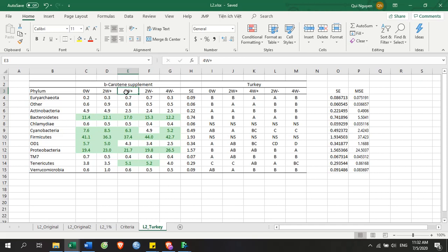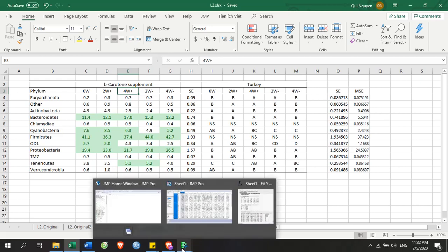So okay, now I will show you how to analyze that.